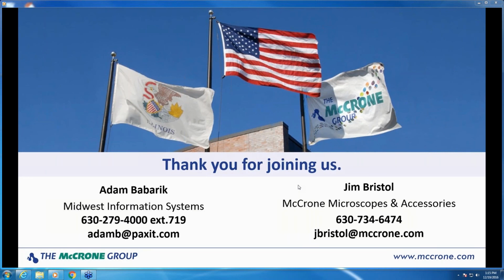We actually have one here from Chris. Chris is asking, other than a conventional style microscope, what other optical systems can PAXit Extended Security work with? That's an excellent question.